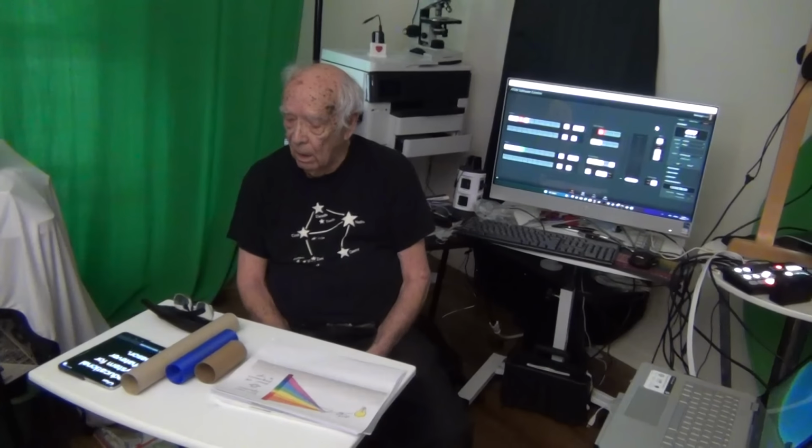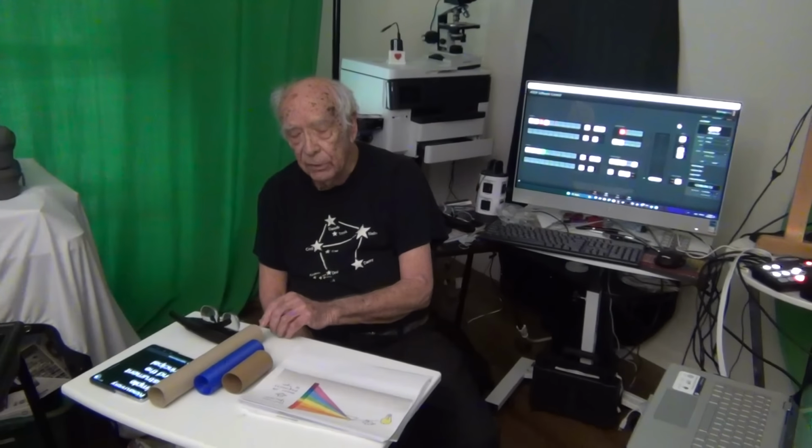Okay, what we're going to be centering on today is spectroscopy. Spectroscopy is probably the most used instrument in science, and it's probably the least taught instrument in our educational system for whatever reason. Relatively simple instrument, and the principles are relatively simple.